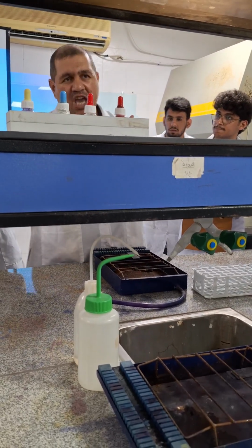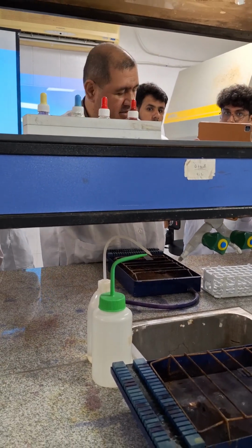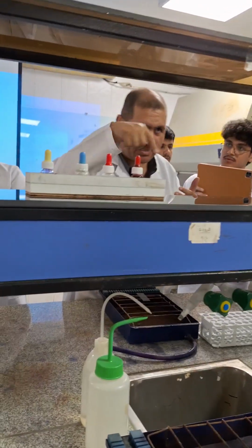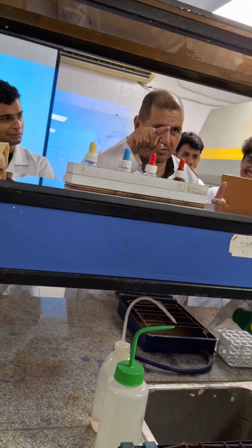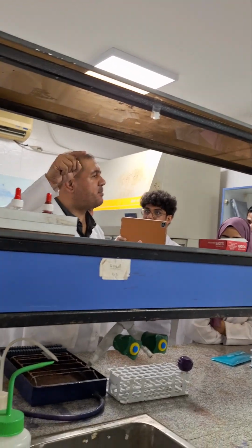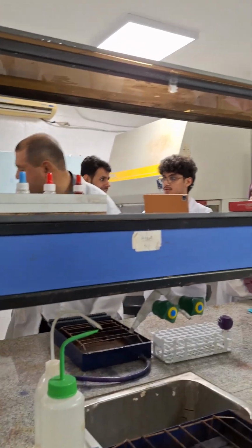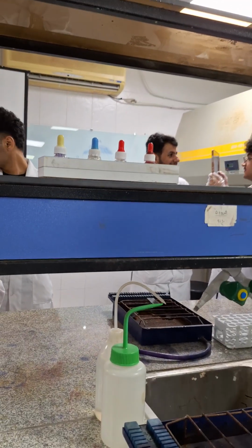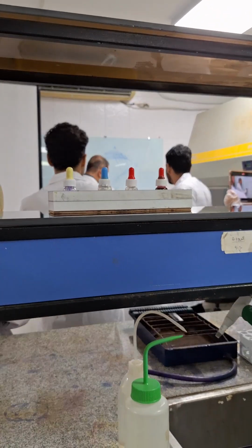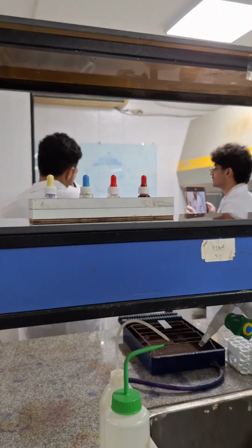Bacillus or rod shape. Coccus is spherical. And a spiral bacterium is spiral.